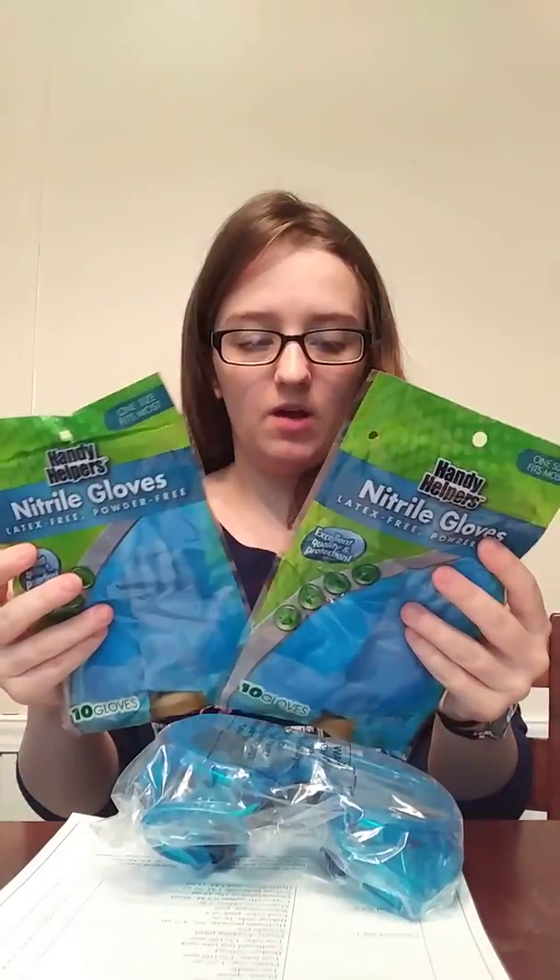They're separated by different sets — that's how they're packed. So I'm just going to go down the list. The first one is the safety set, which has one set of safety goggles, two packs of gloves, and a lab apron. So there I've got my goggles, two packs of gloves, and a nifty lab apron. This is actually really thick material — I definitely thought it would just be some flimsy stuff.